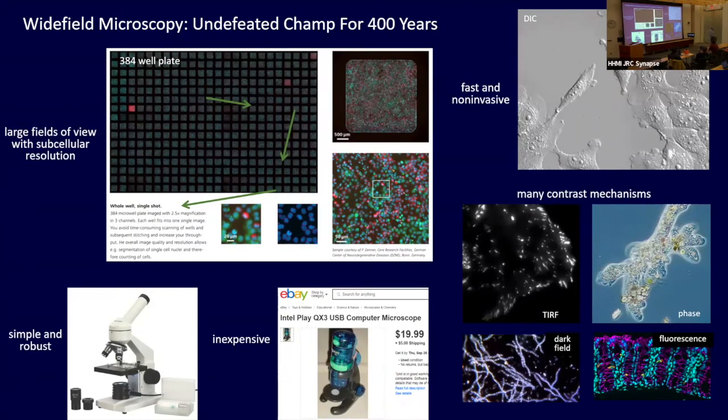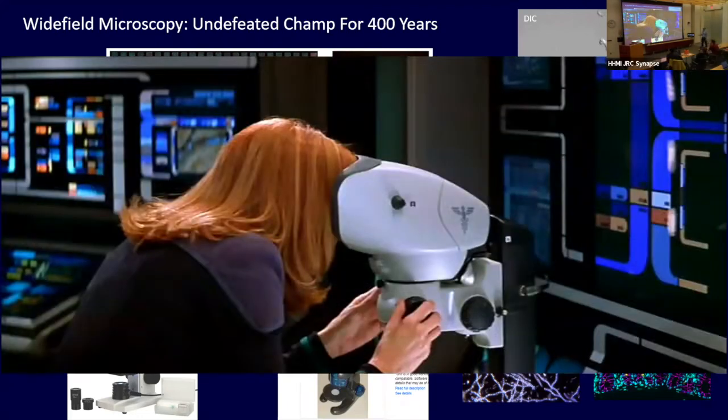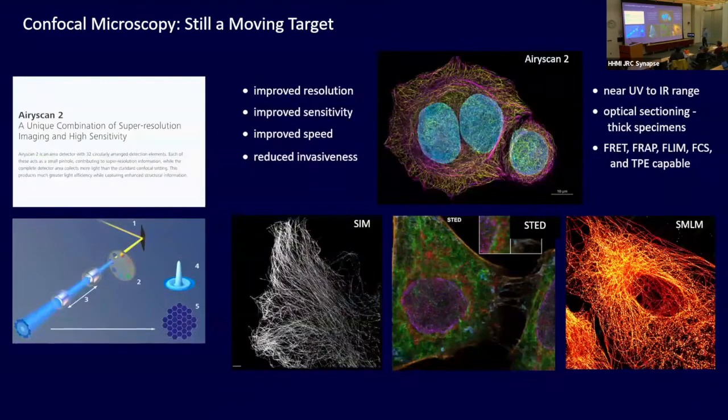About 80% is that. About 10 to 15%, well, let me just say that it's so popular that predictions are that it's still going to be used 300 years from now. Okay, so the other one is the confocal microscope, because the wide field's major limitation is you can't really look in thick tissues with it. So you need something that has optical sectioning capability.